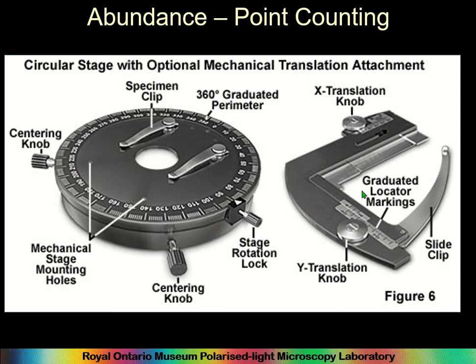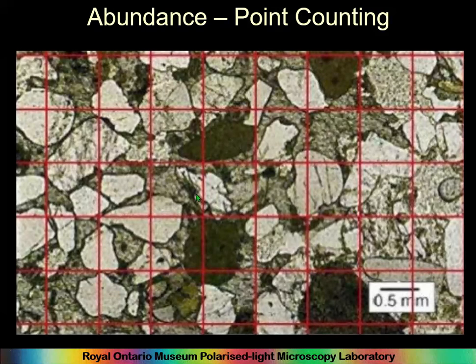It's calculated for the common type of grain size you get in granitic or metamorphic rocks. To do this properly, you need to calculate the count interval you're working with. You can't just go any old interval that you like. The interval has to be calculated based on the grain sizes you have within your fabric.